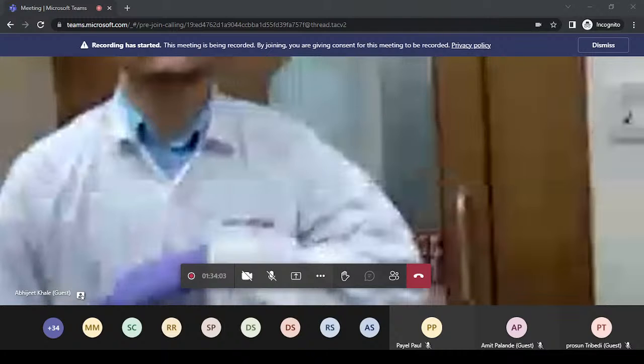The next module is the automated multiple development module, that is the CAMAG AMD2 module. Here we are using it for gradient type of HPTLC. At a time, we can place 5 different solvents or 5 different mobile phases in these jars. And in this assembly, we can hang the plate here, 20 by 10 or less than that dimension. And the gradient program we can select in the software. The gradient program is based on the polarity of your applied sample or applied analyte and the polarity of different solvents you have kept in these jars.